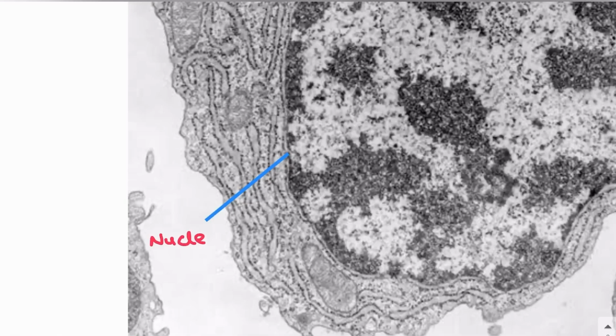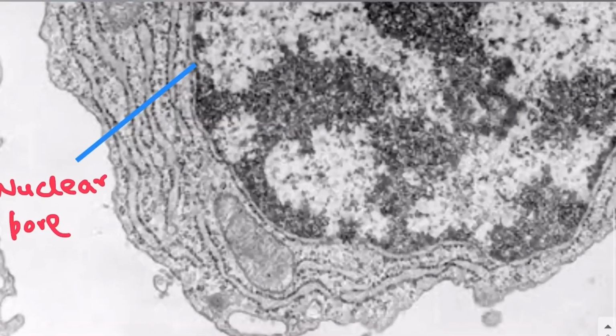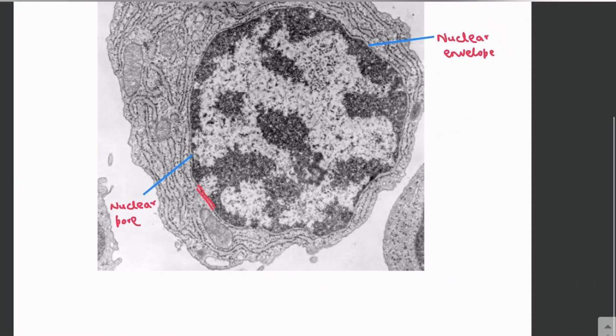So guys, you know that the nuclear membrane is a double membrane. So basically this is a double membrane going on, right? Which is the nuclear envelope. So we have labeled the nuclear envelope and we have labeled the nuclear pore.